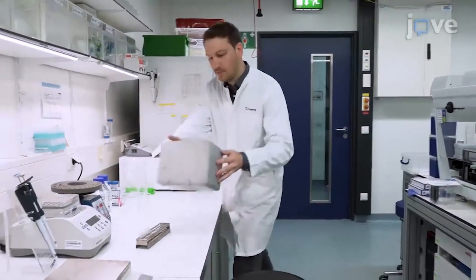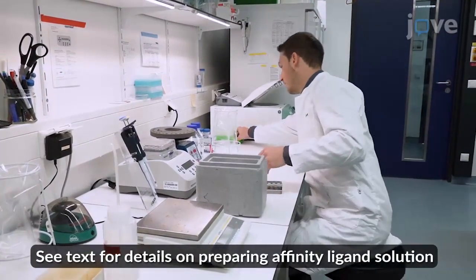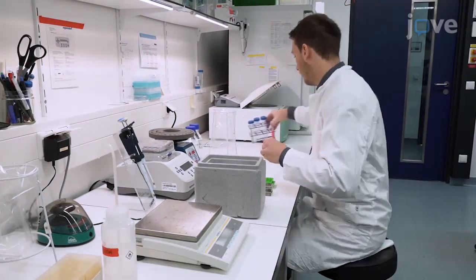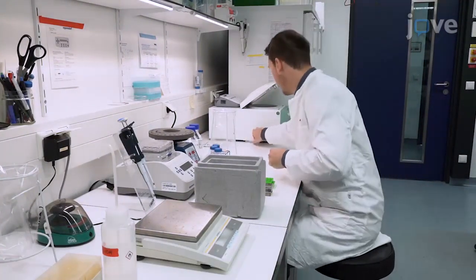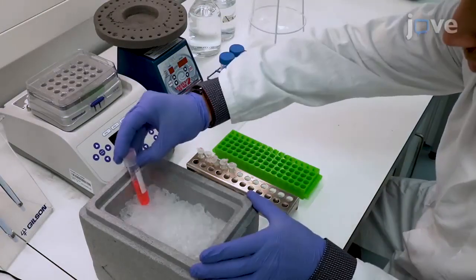To begin this procedure, adjust the concentration of the prepared affinity ligand solution so that it is in the range of 0.5 to 15 grams per liter as defined by the design of experiments. Store the solution on ice until the coupling reaction is ready.